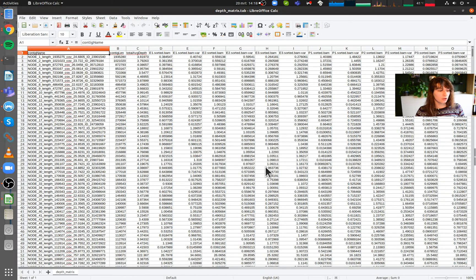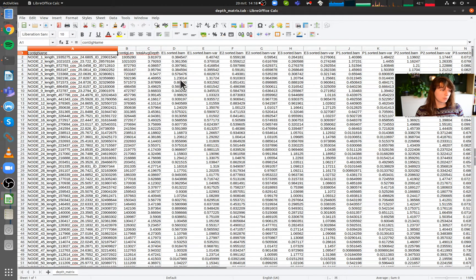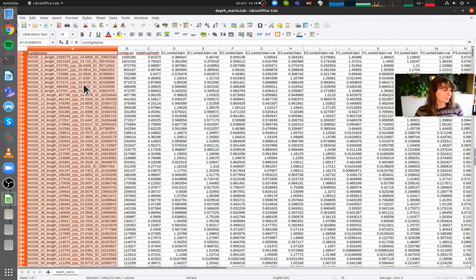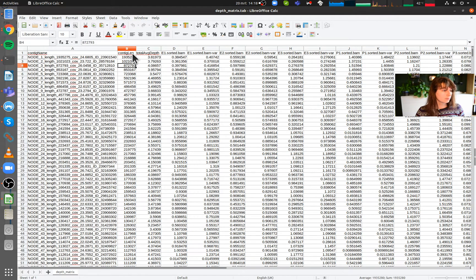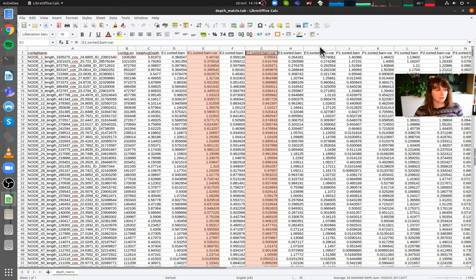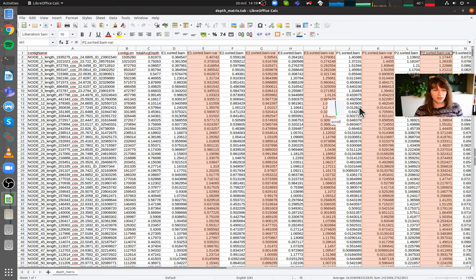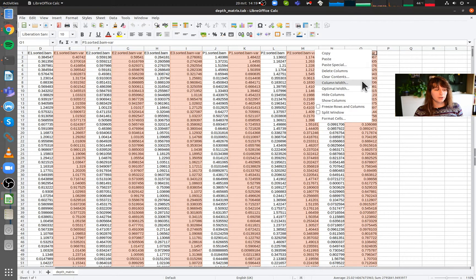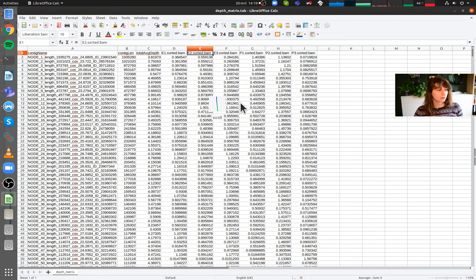This looks a bit more organized already. Now we're going to clean this up — we don't need all this data. There's the contig name, contig length, average depth, and then depth per sample. There's also the variance columns, which I'd rather not have. So I'm going to select all the columns that end in 'var', right-click, and delete columns. A bit better already.